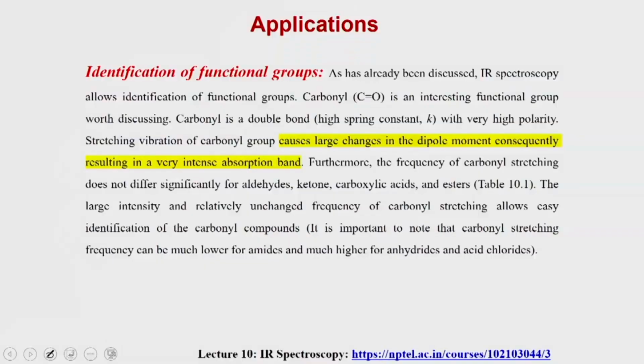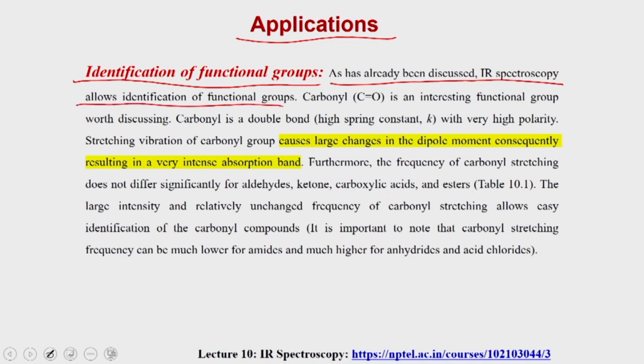So, what is the application of IR spectroscopy? As I said, the first and foremost application of IR spectroscopy is that it will allow you to identify the functional group. As we have already discussed, IR spectroscopy allows the identification of functional groups.